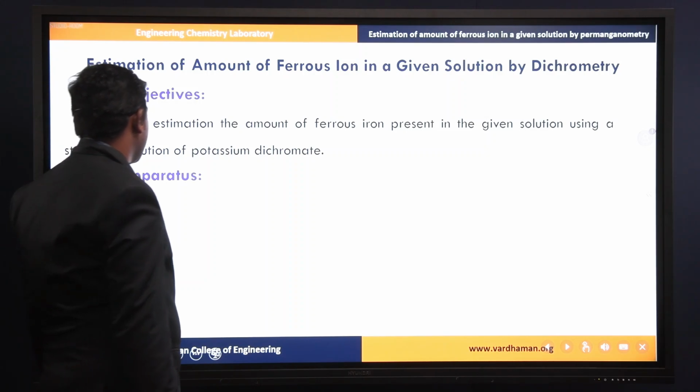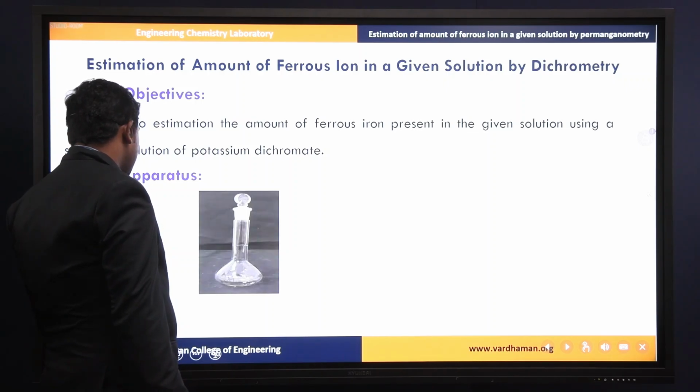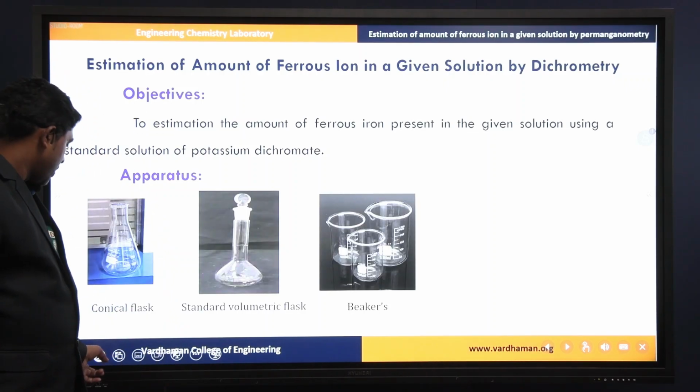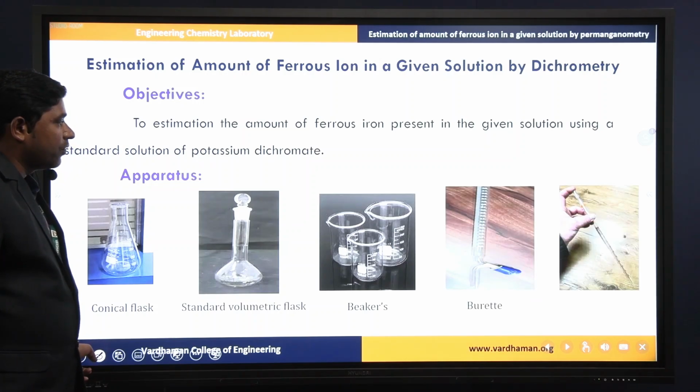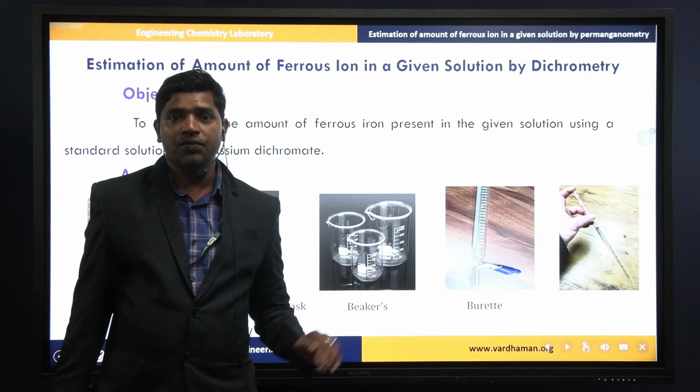Apparatus required: we require a conical flask, standard volumetric flask, beakers, burette, and finally pipettes. These apparatus are required for this experiment.